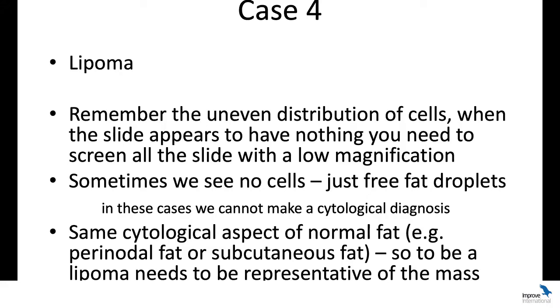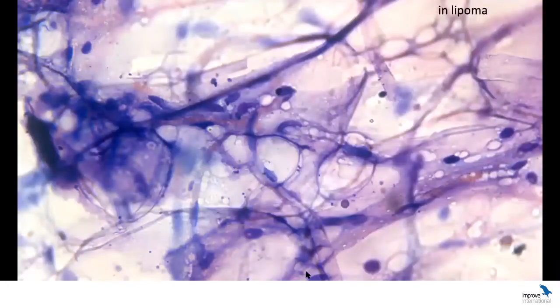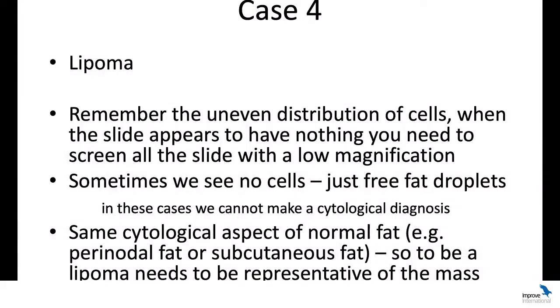In these cells, the nucleus are very condensed. There's no nucleoli. They're relatively regular in size and shape of the nucleus as well. It tends to be oval or ovoid and very condensed chromatin. So dark chromatin with no nucleoli, fairly regular in size. A liposarcoma tends to show anisocytosis, anisokaryosis, lots of criteria for malignancy.